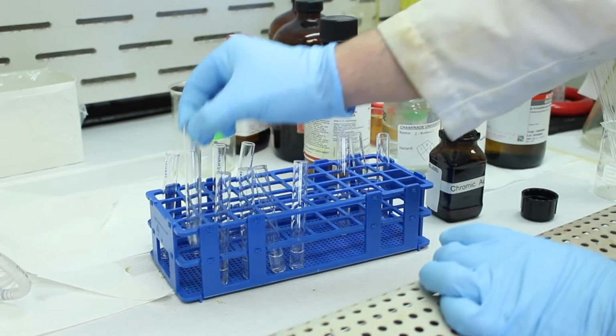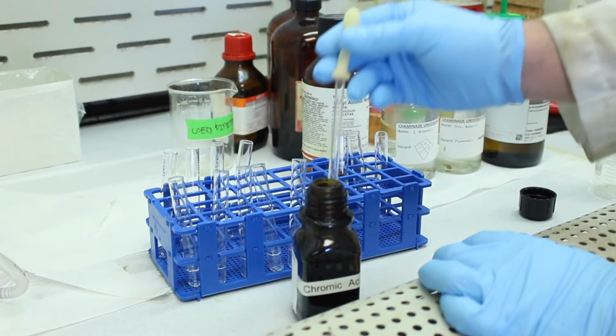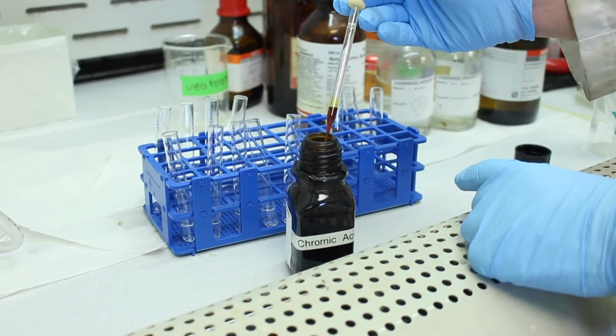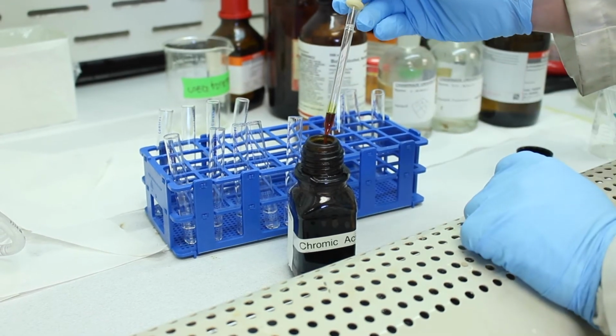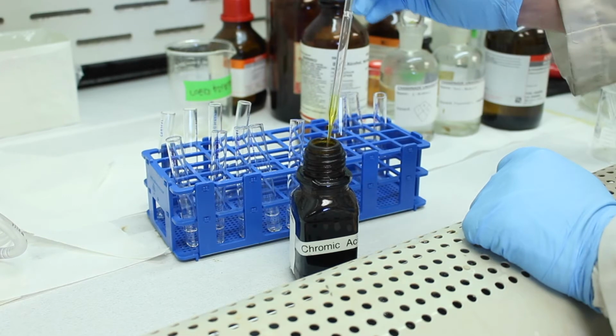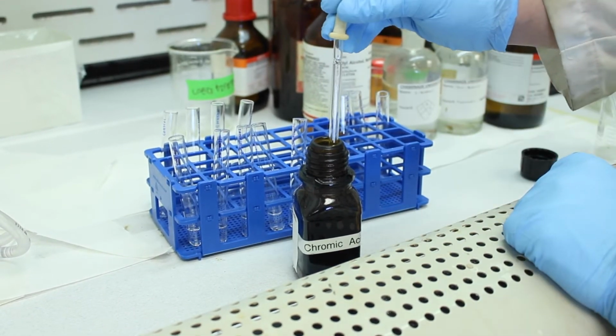Okay, so what I'm going to do is I have some chromic acid here. This stuff's pretty corrosive and also carcinogenic. I didn't mention it in the pre-lab, but this chromium in this oxidation state, 6+, is sometimes referred to as hexavalent chromium, and it's a known human carcinogen, so not that pleasant stuff. So you should be careful, try not to spill it anywhere.